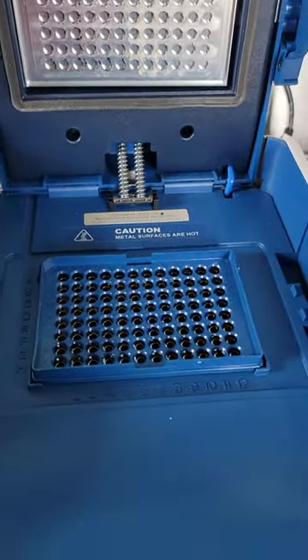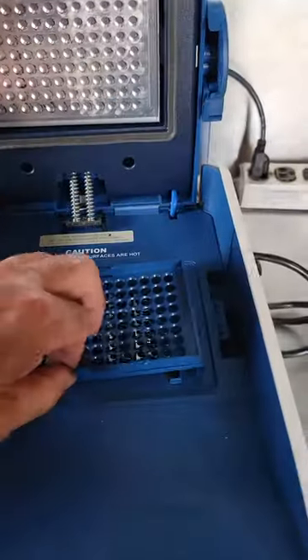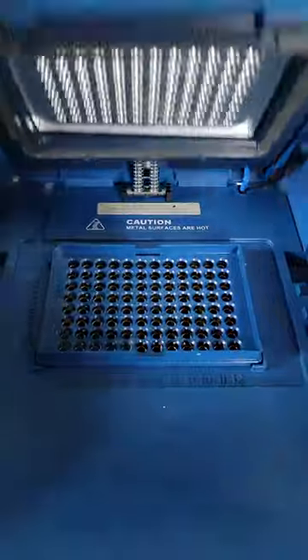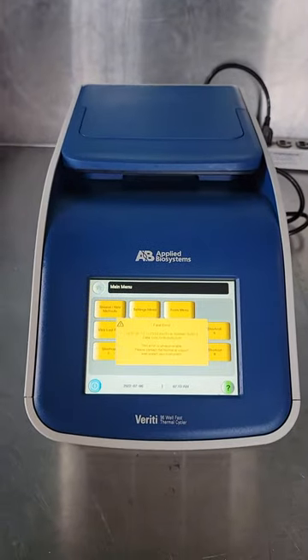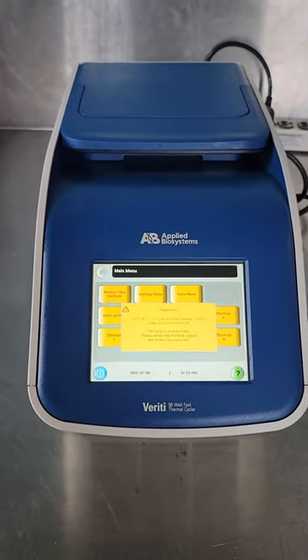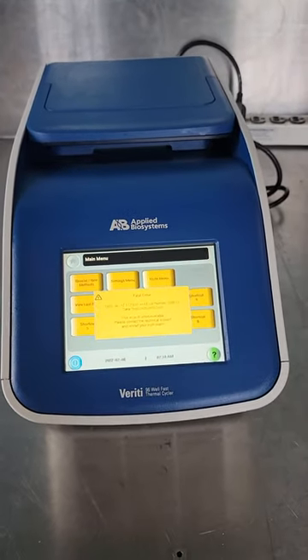There you go, it powers off. It's really clean, but we don't know what this fatal error is. Once again, this is an Applied Biosystems VeriFi 96-well thermocycler. Thank you so much.